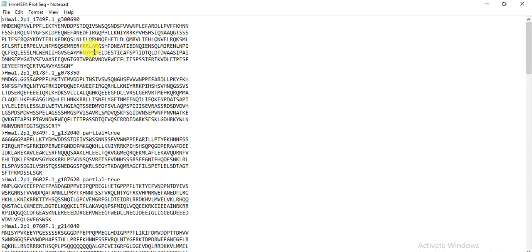Now you have these protein sequences and can also extract CDS sequences the same way. For downstream analysis — gene structure, motif analysis, synteny analysis, GO annotation, and other genome-wide analyses — I have a series of lectures you can follow using these sequences. Hopefully this video helps. If you have any questions, please let me know, and don't forget to like, comment, and share. Thank you.